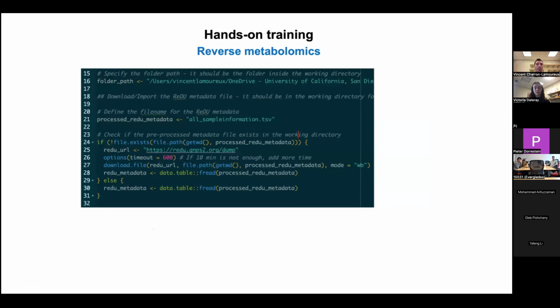All right, assuming that everyone has gotten to this step, we do want to specify the folder path, which is the input fast search folder inside of the CMMC Workshop folder, which was our working directory. Just to recap again, these are the data CSV files from the fast search.